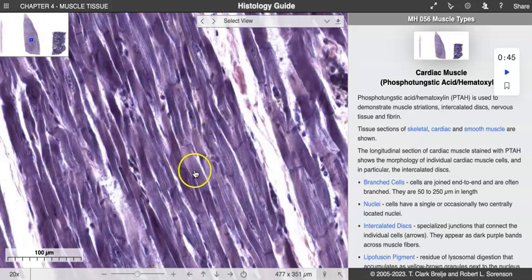And the comparison between skeletal and, let's say, cardiac muscle cells is, again, the sizing. So these cardiac are much smaller, but also cardiac muscle cells only have 1 nucleus per cell, whereas skeletal have multiple. We also can see these intercalated discs popping out kind of right away, which are these dark bands that are running perpendicular to the direction of the muscle cell or muscle fiber that we see here. So again, these little dark bands, or sometimes they're white in the staining process, but yours and these actually are dark, okay? So your slides is what I mean.